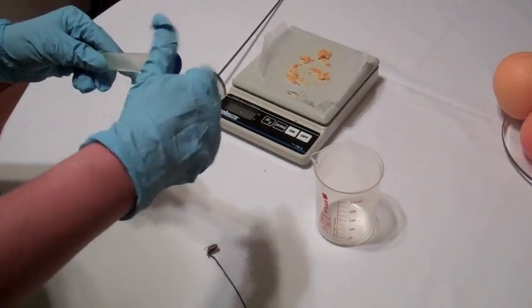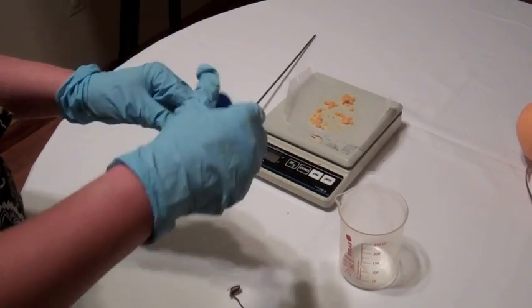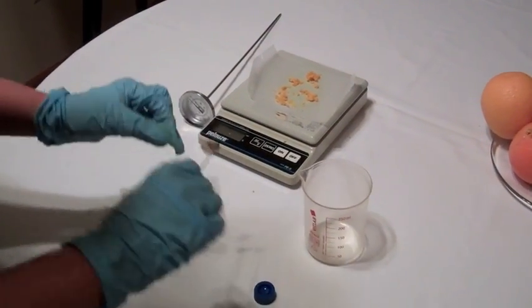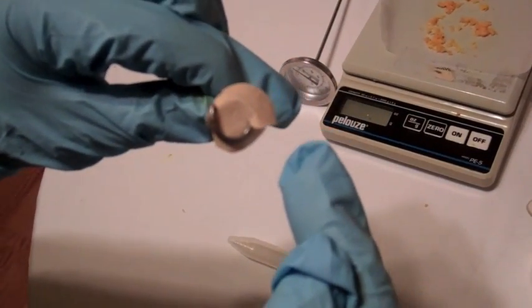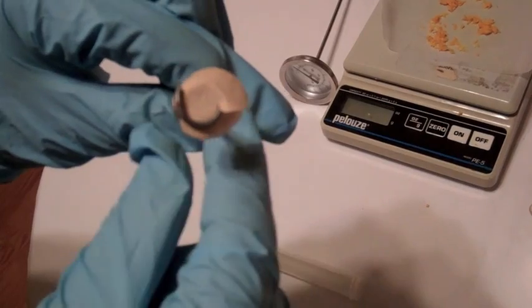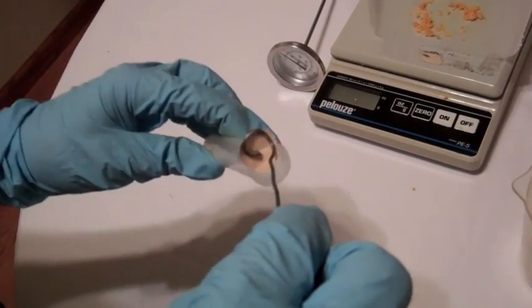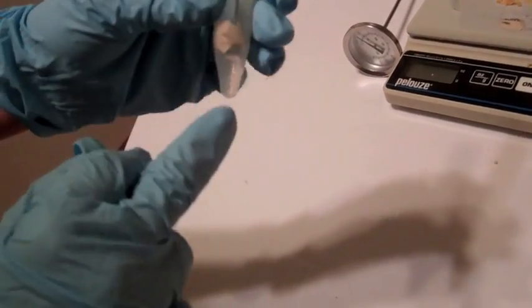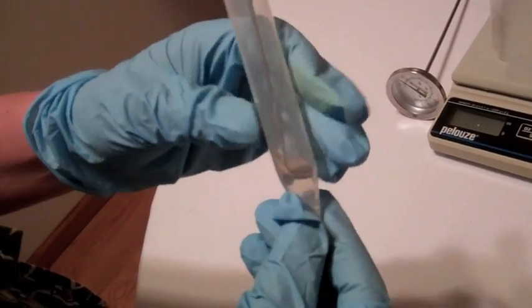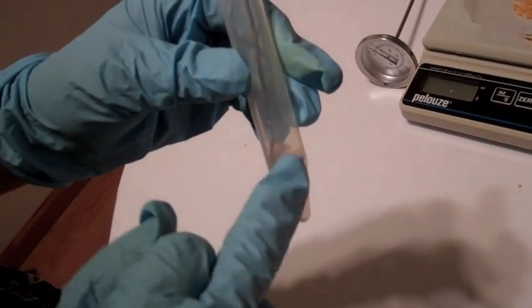We're going to take our 15-milliliter centrifuge tube and insert a pre-made wire that we've coiled at the end and inserted a piece of coffee filter paper. This is going to serve as a divider of sorts so that the orange rind can sit on top without going to the bottom of the test tube, separating the orange rind from the limonene as it is extracted.